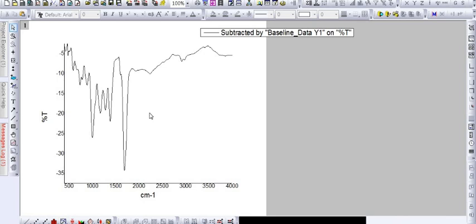Now the next step is the signal processing. For the signal processing, since we got the transmittance on our y-axis, it means the signal, as you can see, at some point the sensing is very high, so we got the very large peak, and at some point the sensing is low, at some point the sensing is medium. So in order to see the proper peaks and sensing, the next step is to go for the signal processing, and for that we need to do the smoothing so that we can see proper signals.